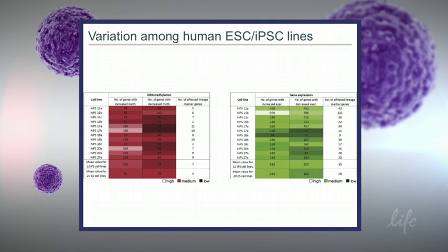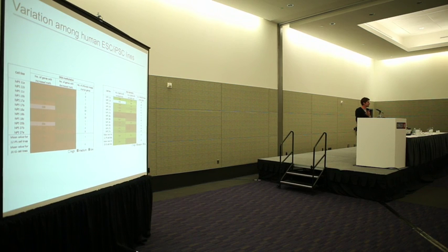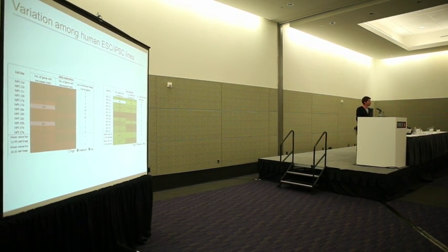Now, on a genome-wide scale, for DNA methylation and then bringing back the gene expression, we can obviously quantify this. But what we really wanted to do is, because that's in the undifferentiated cells, and it's very nice that we can see these differences and even make conclusions in predicting forward whether or not these cell lines will differentiate into these particular cell types, or at least induce a subset of the markers.